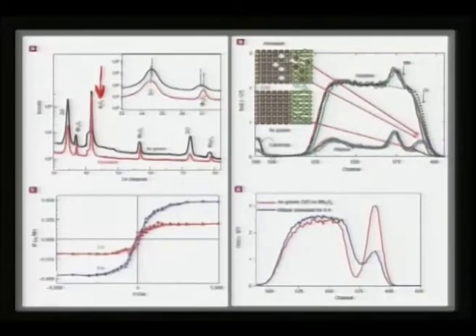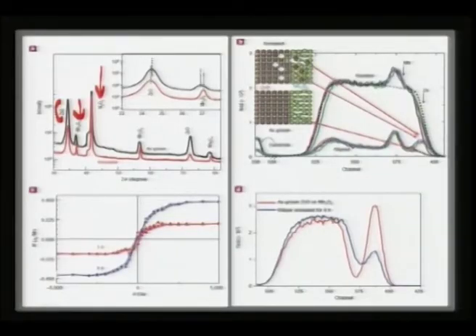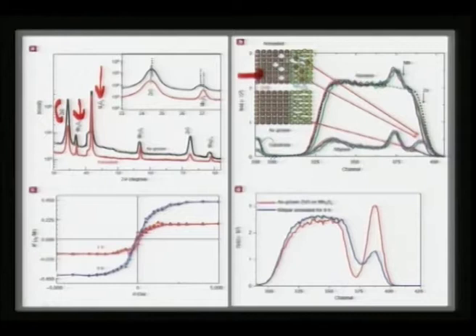So, you take a single crystal of Al2O3, and then you put zinc oxide up to 700 angstrom, and then over the zinc oxide you put manganese oxide. So, how does it go? It is almost as depicted here. You first take the alumina peak, that is your sapphire substrate, and then epitaxially grow this much of zinc oxide, and after that you grow a Mn3O4 layer, which is marked with green circles.